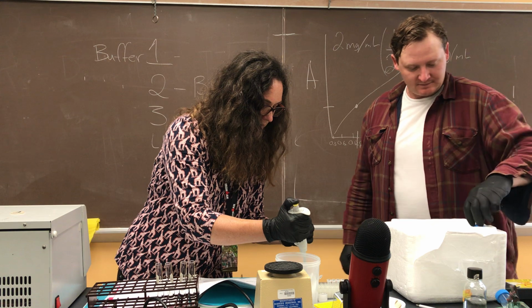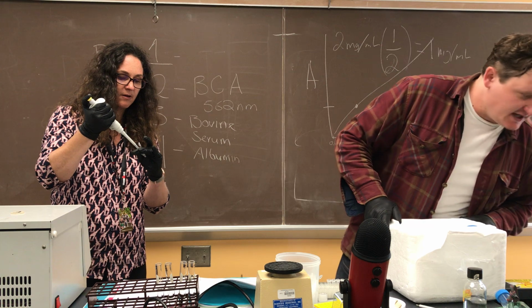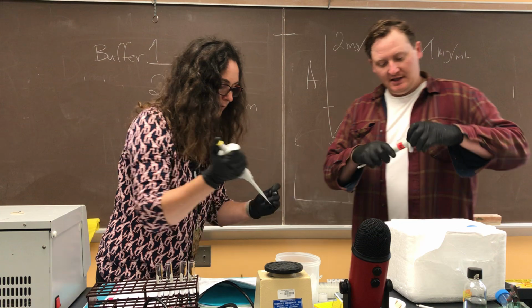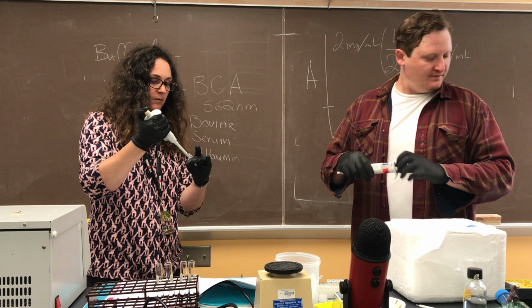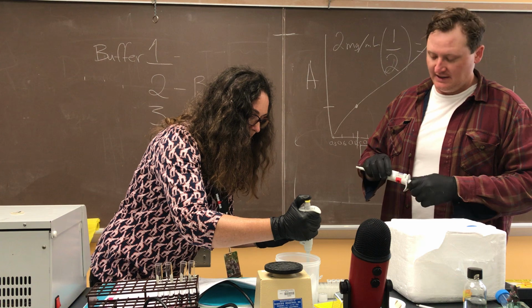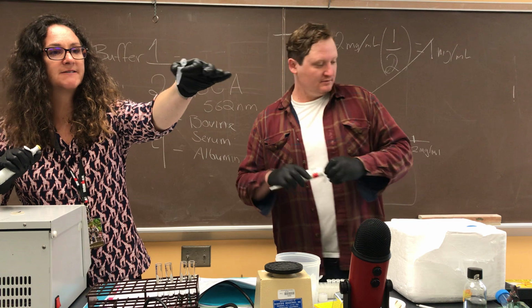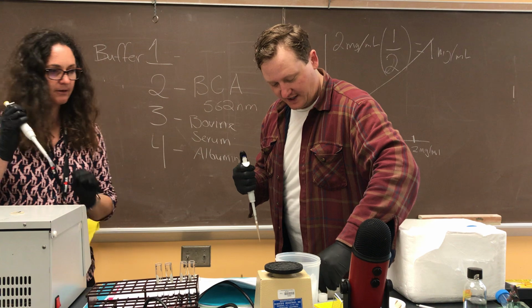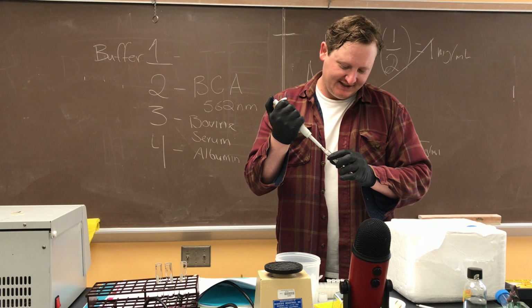Okay. Perfect. So now you can add 200 microliters of each of the 4. Okay, you got it. Oh, actually, I need another P or I can use this P1000. Okay. And are those buffers now in order from 1 through 4? Awesome. Now we have just the pellet of cells with no fluid on it anymore. Oh, sorry. That's okay. Pellet's fine, as long as the pellet's fine.